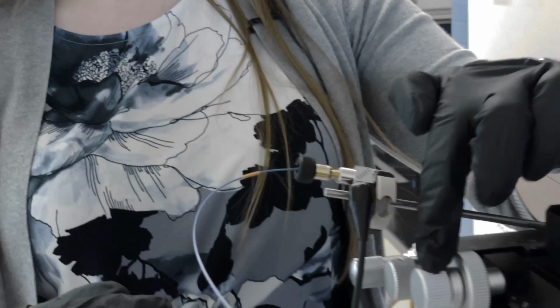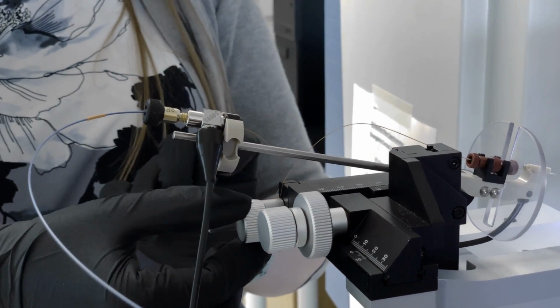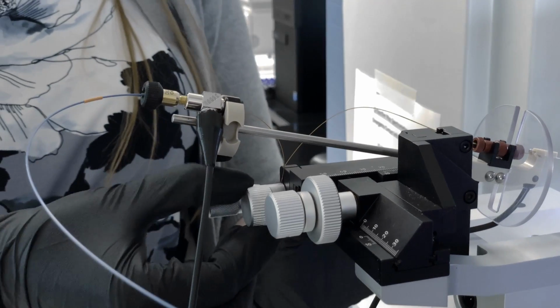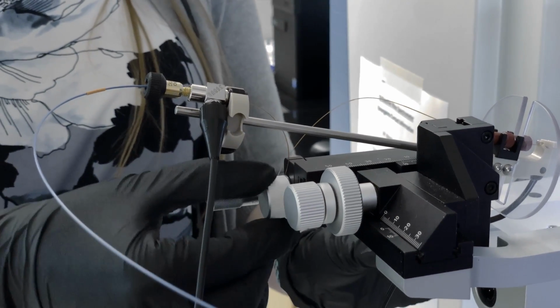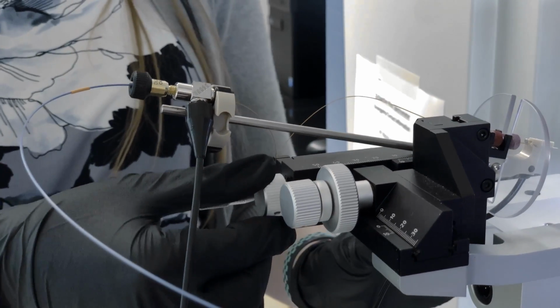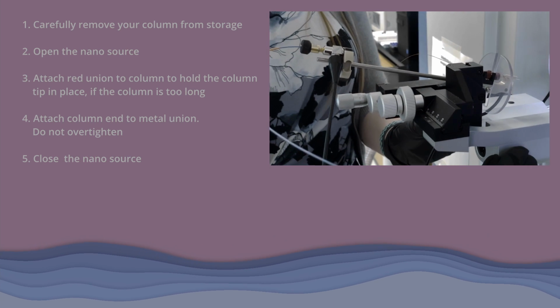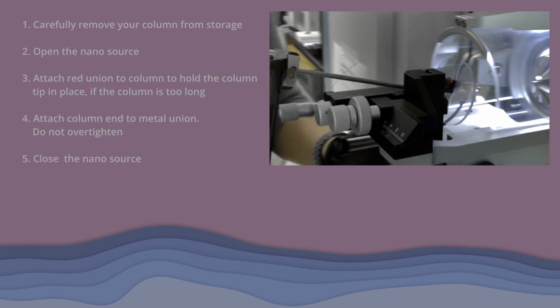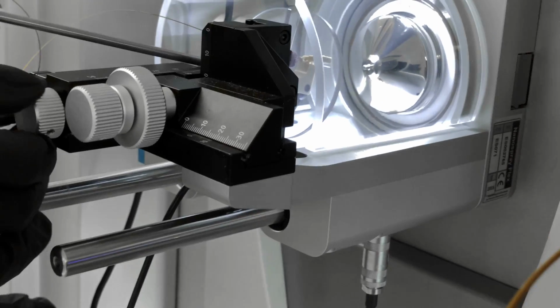These three knobs are responsible for adjusting the placement of your column. This one here adjusts the front and back position. So pull this all the way back before you close the nano source again to ensure that you don't slam the tip of your column into the ion transfer tube. So once that's back, we can close the source until it clicks. Then we can reposition the column by slowly moving forward.